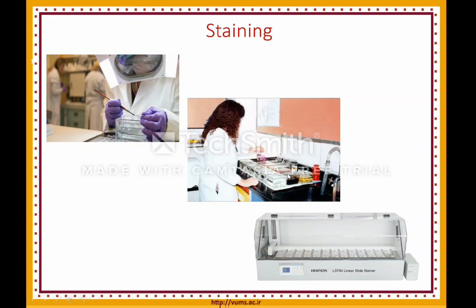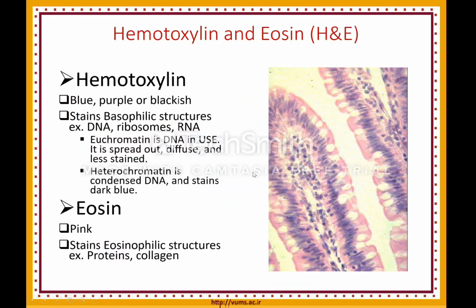the tissue is stained, and in the last steps, the water that we removed from the cell at the first step is returned to the cell by alcohol that decreases in concentration.